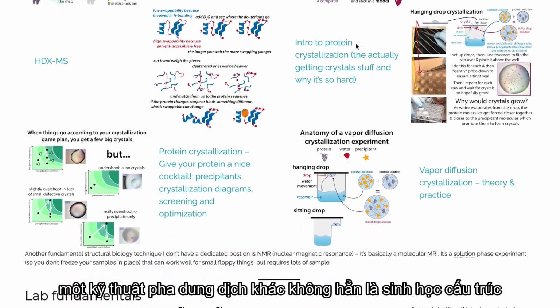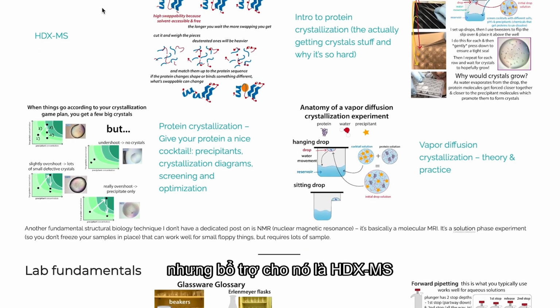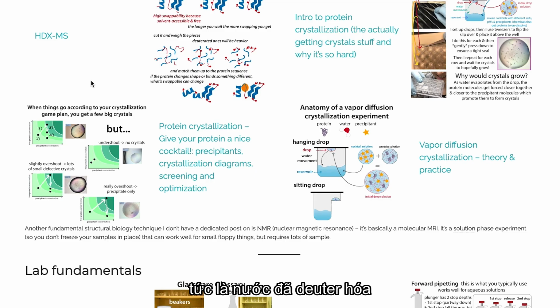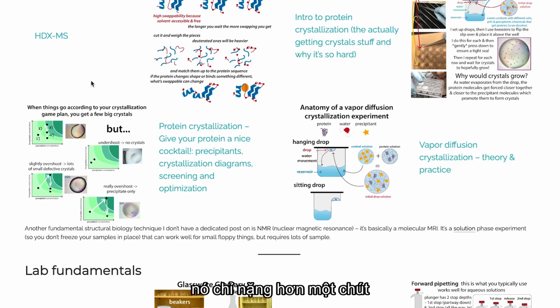Another solution phase technique that isn't really structural biology, but is complementary to it, is HDX-MS, hydrogen deuterium exchange mass spectrometry. Basically, you give your molecules a bath in heavy water, so deuterated water. It's a version of water that acts just like water, but it has deuterium instead of hydrogen, which has an extra neutron.